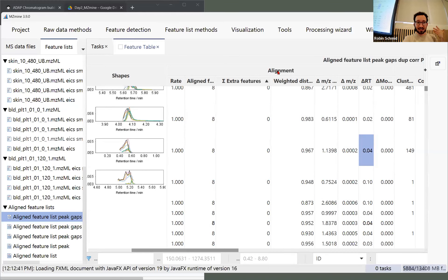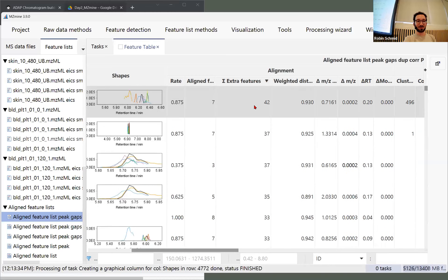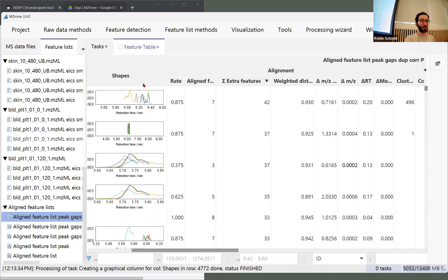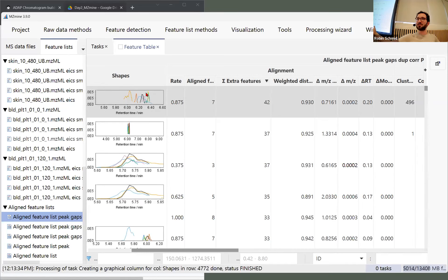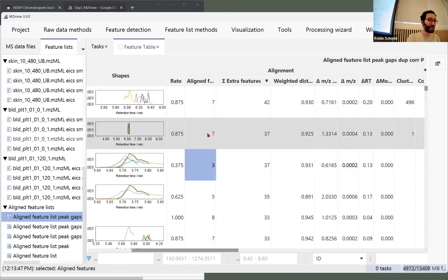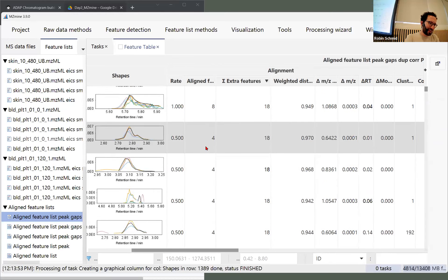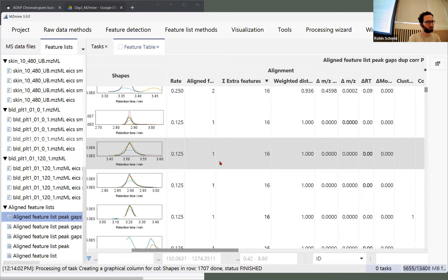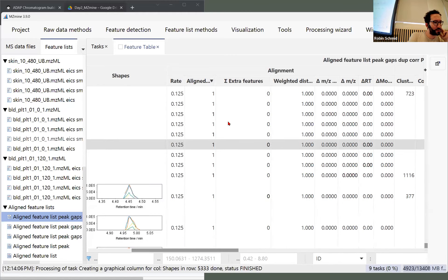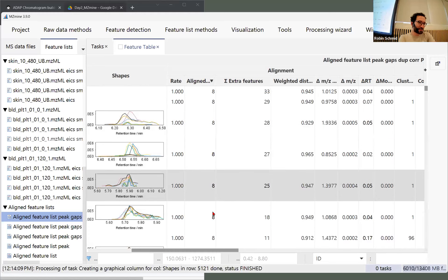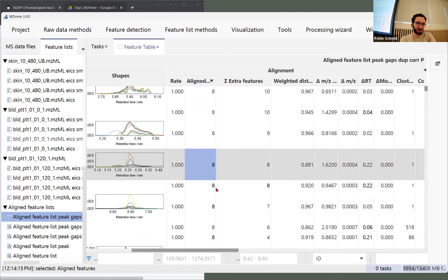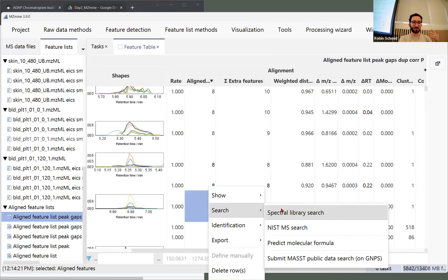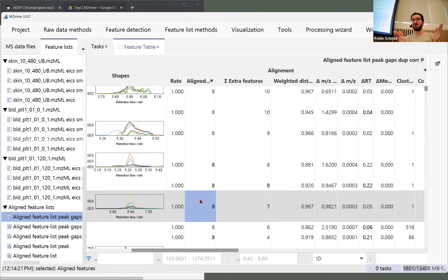We also want to look at extra features being drastically too high. We already see it's very high because we opened the alignment window to plus/minus 0.4 — that's a lot. Looking at samples where we have eight aligned features and then maybe 16 extra features — a very common scenario is one isomer detected in all samples giving eight features for one and eight features for the other. They were so close that the alignment had to distinguish them.